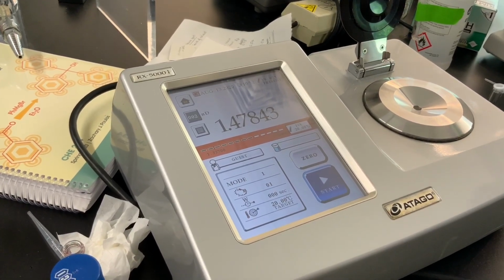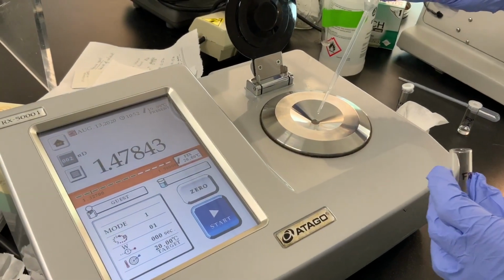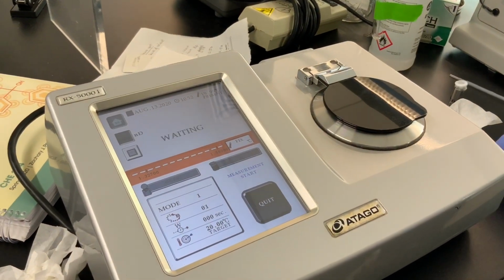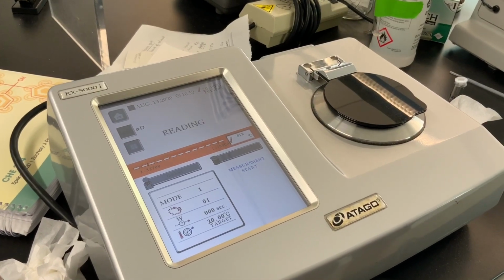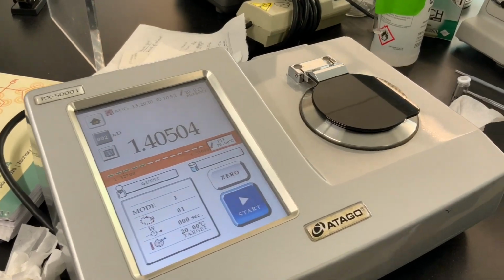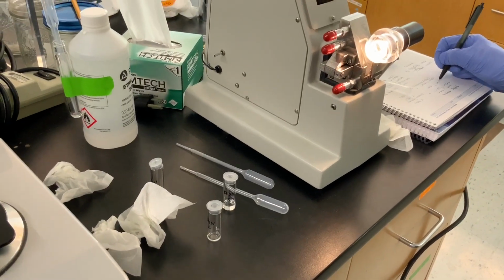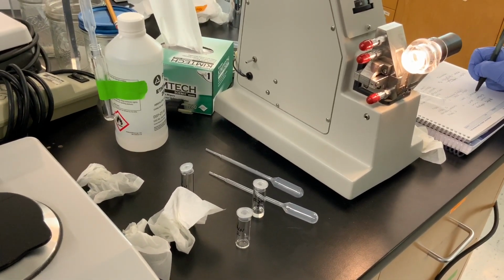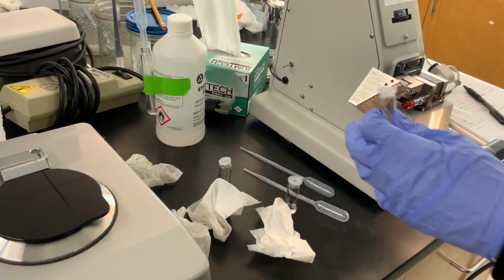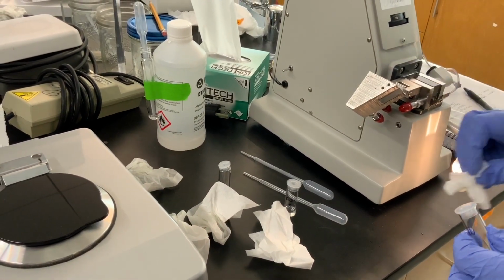Fraction 2. .40504. So that means I must have read it wrong on here, right? Again.